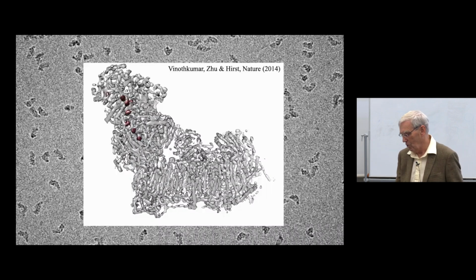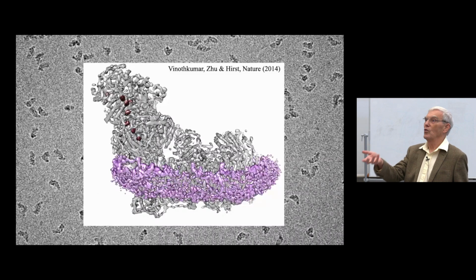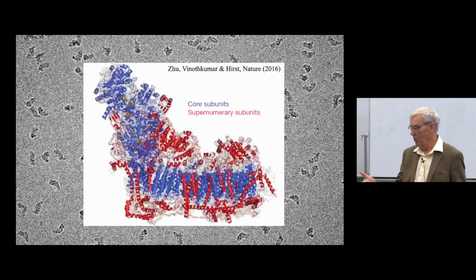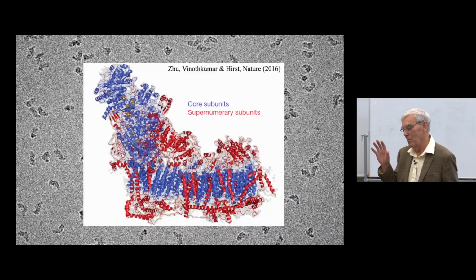But also in this picture, you can see that there's a region with 76 transmembrane alpha helical segments of the protein, and then at a lower contour level, the detergent that you use for extracting the membrane protein, and then with a bit more work, an atomic model with 45 different subunits, all built nicely into that map without any crystals and with a minimum of, well, a year or so of work.